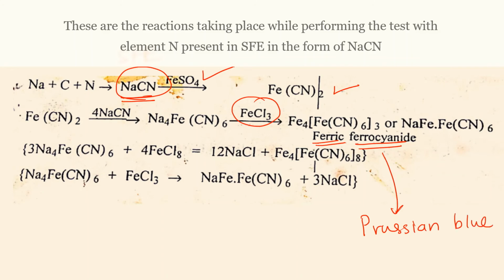Based on the structures, there are different reactions possible, and you can note down these reactions, but the color ranges from blue to green.